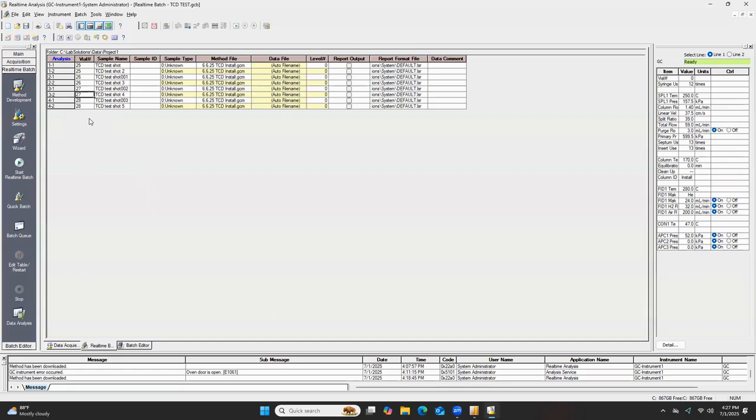Okay. So I just wanted to show you guys that. If all of your temperature parameters and all of your flow rate parameters are the exact same for the two, then you can do it this way. But like I mentioned earlier, my GC specialist said to keep the packed column temperature for the TCD between 40 to 60. Like I said, I've got that written down here.